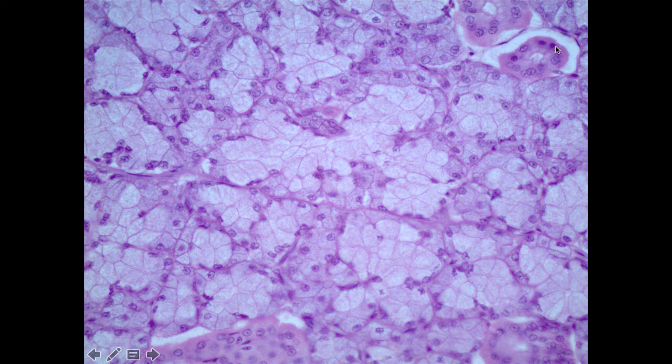And typically, these ducts are going to be composed of simple cuboidal. And so these may look familiar. They may have that simple cuboidal shape, and that's because simple cuboidal is one of the more common tissue types that we find in the ducts of our salivary glands.